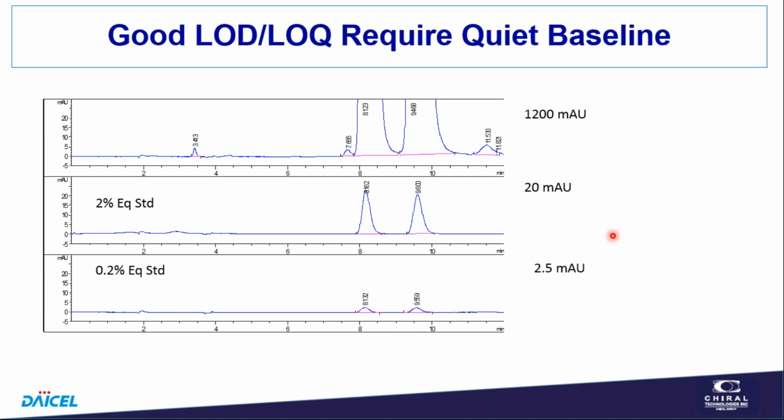And good LOD, LOQ requires a quiet baseline. We'll talk about this a little bit more in a later slide.